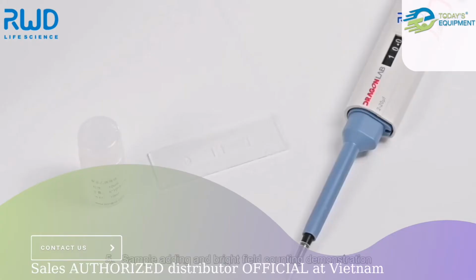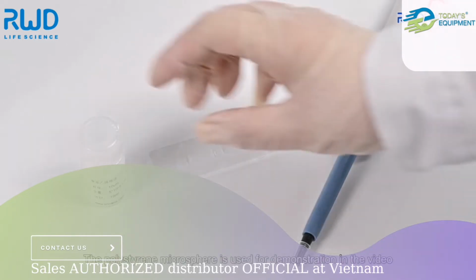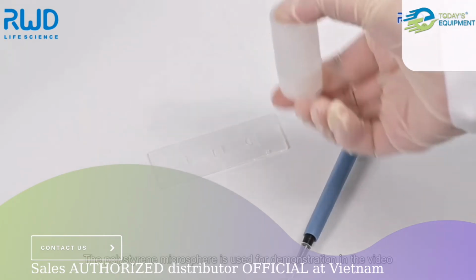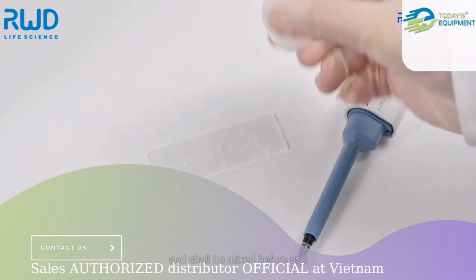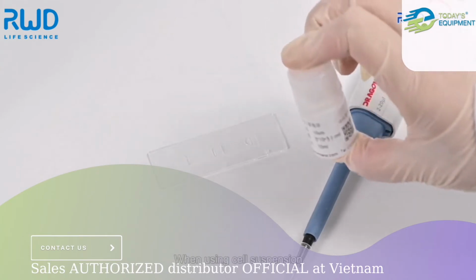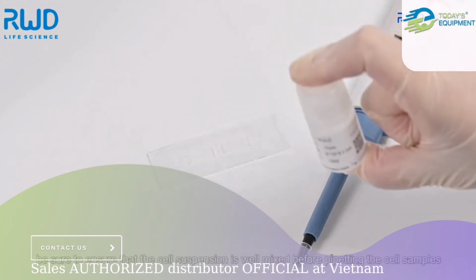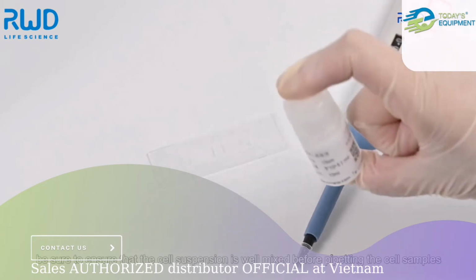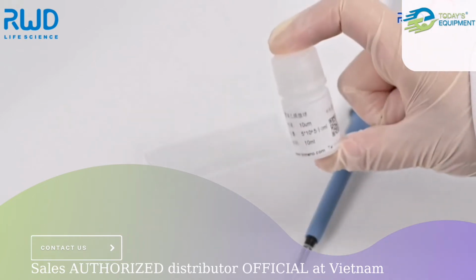5. Sample adding and bright field counting demonstration. The polystyrene microsphere is used for demonstration in the video and shall be mixed before use. When using cell suspension, be sure that the cell suspension is well mixed before pipetting the cell samples.